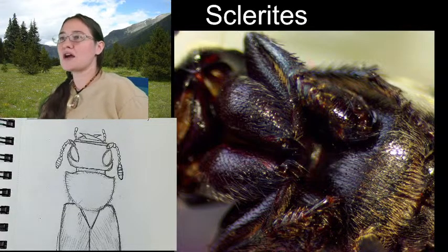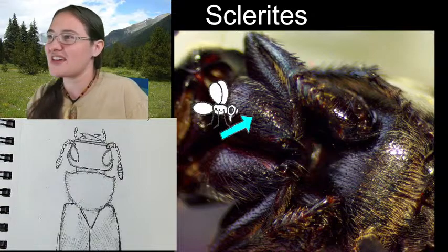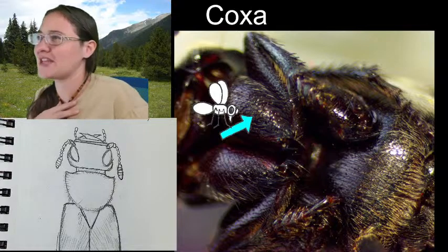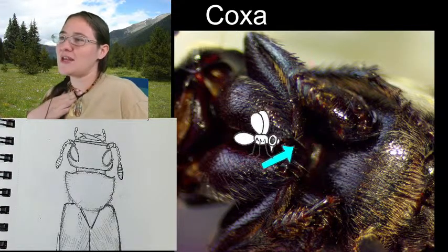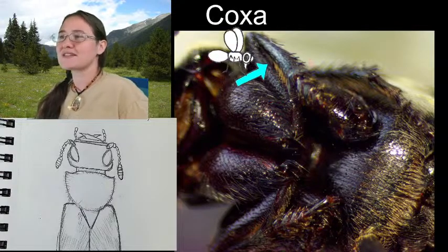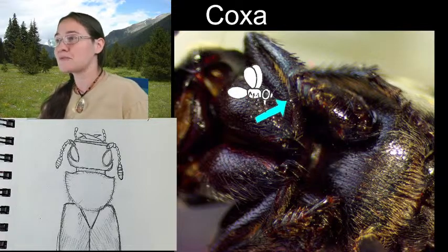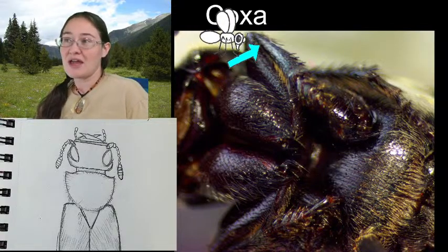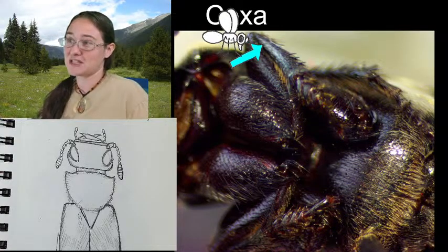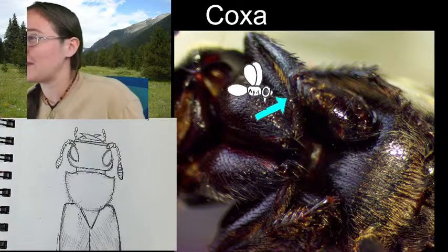All right, so we are looking at the front leg. This right here is what we call the coxa. That's kind of my insect's hip bone. It's spelled like this. We have a little itty-bitty kneecap down here that we don't have the ability to see, called a trochanter, but the rest of these segments on the leg have very similar names to human bones. The first segment is the femur, and then the second segment is the tibia, right? So it's like from the hip to the knee and the knee to your foot. Once you get to the end, we call these tarsal segments.